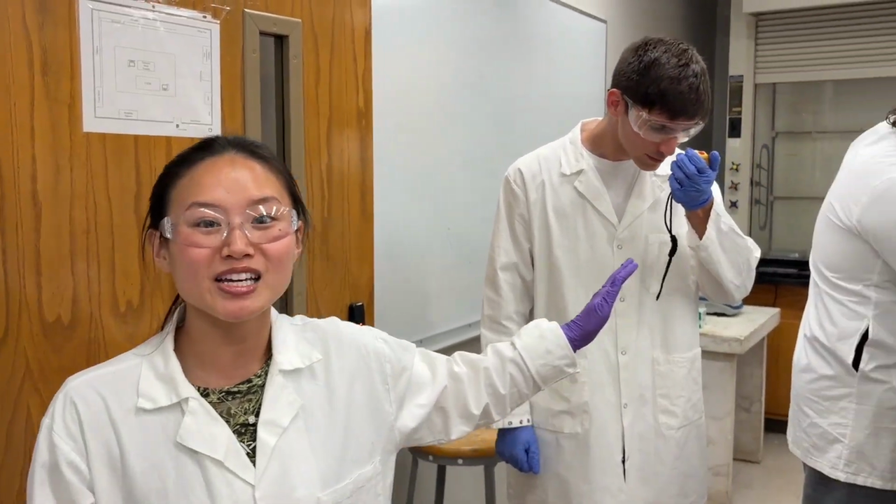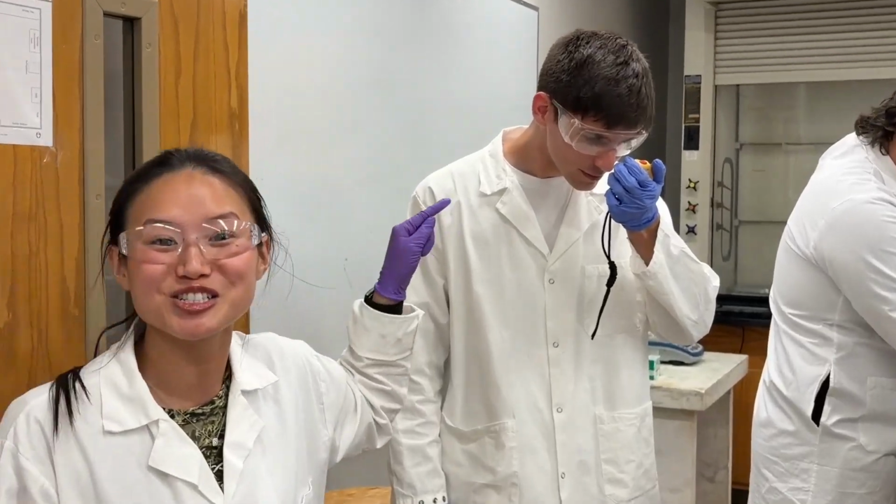An important part of this experiment is that we split up tasks. Somebody, when you start the dilution, needs to be paying attention to the timer.